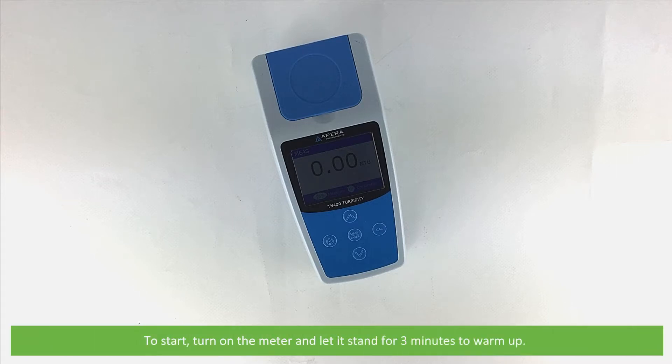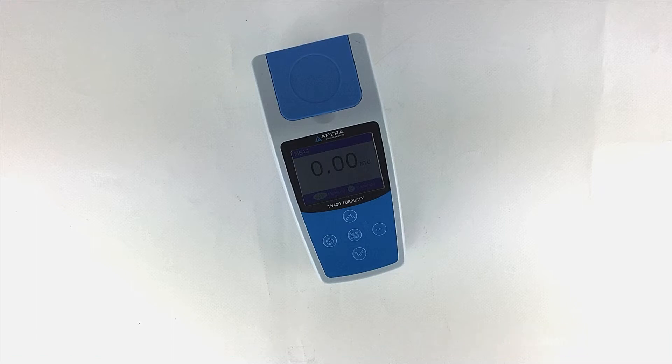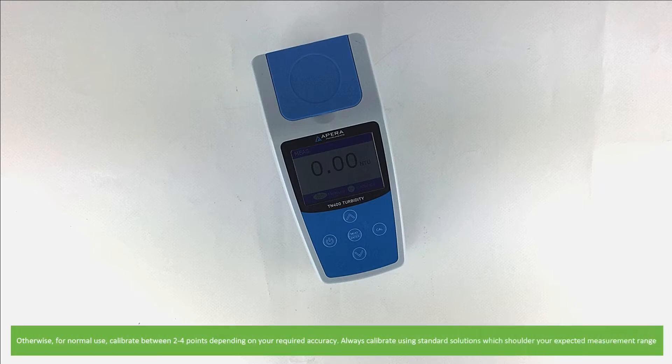To start, turn on the meter and let it stand for 3 minutes to warm up. If it is the first time using this meter, you'll need to perform 4 points of calibration. Otherwise for normal use, you can calibrate between 2 to 4 points depending on your required accuracy.